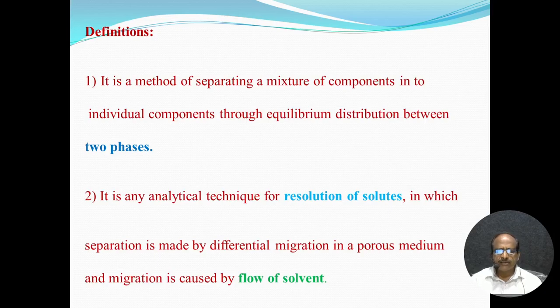What is the definition of chromatography? In this method, you separate a mixture into individual components through equilibrium distribution between two phases. The most important keyword is equilibrium distribution. The individual components are present in the mixture, no problem, but we have to separate them by distribution in equilibrium between the two phases.